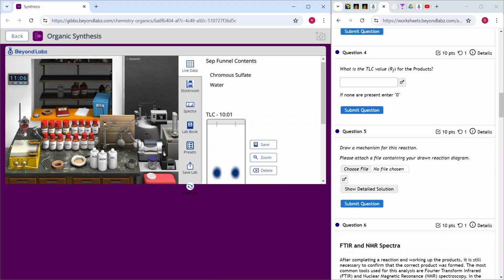Normally, the aqueous layer is the layer that has color, and the organic layer is the layer that has no color in it. We want the organic layer because benzoic acid is in the organic layer. So I'm just going to go ahead and grab the organic layer, just the organic layer, leave the aqueous. I don't care about it over here. So that is my product. And notice at the final stage, I managed to isolate the benzoic acid. I managed to isolate the product. Just the product. I don't want any impurities with it.